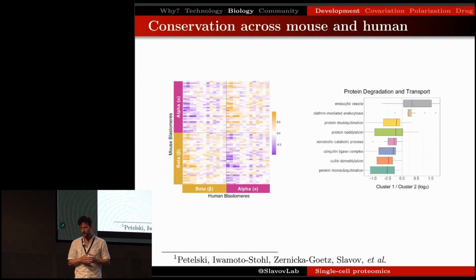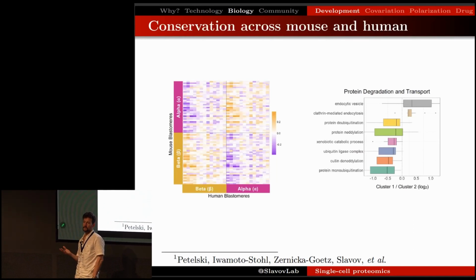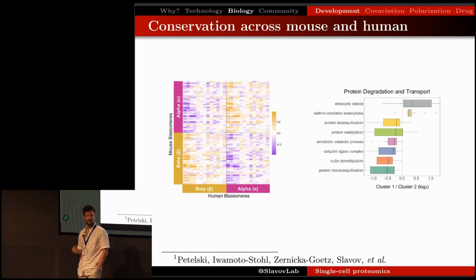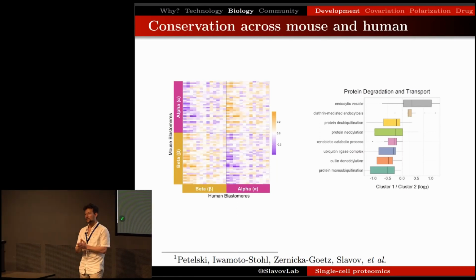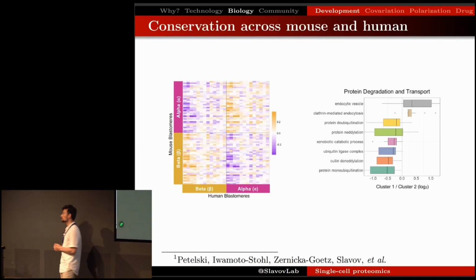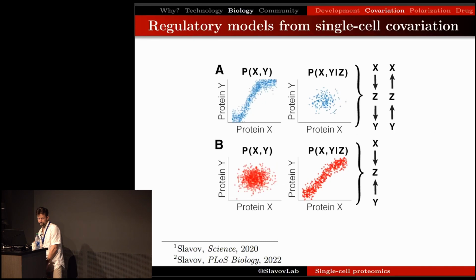and protein degradation. And that provides a compelling explanation as to why those differences are not observed at the RNA level, because at that point, the genome is actually not very active. This is happening prior to the zygotic genome activation. What we have is protein remodeling by degradation and transport, beautifully illustrating the difference between measuring RNA and protein abundances.